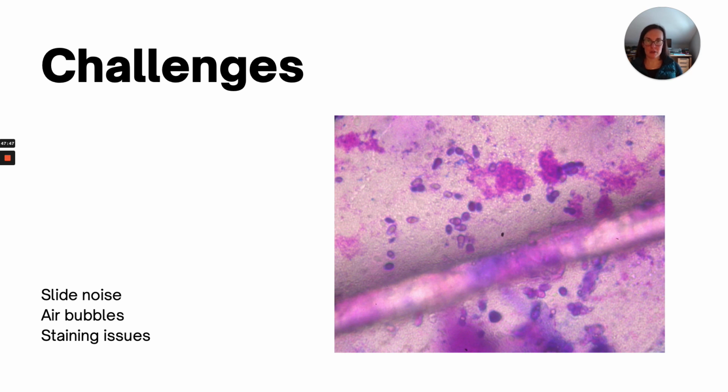And I try to get a blanket image and pick out the things that to me all look the same. And like in this slide, I would say there's yeast. I wouldn't even attempt to decide if there's bacteria here. I would go back if I thought maybe there could be a bacterial pyoderma. I might go back and do an impression smear.